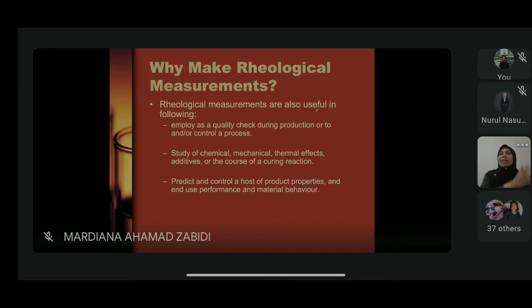Okay, tak apalah, nanti yang tu baguslah juga, nanti you all belajar pasal pumps tu. We have single acting pump, dual acting pump, and etc. Okay, so why make rheological measurement? Alright, this one is for quality checking during production or for controlling a process.